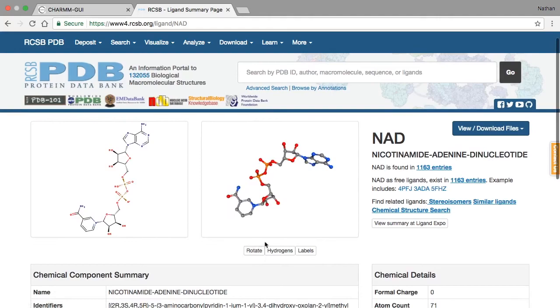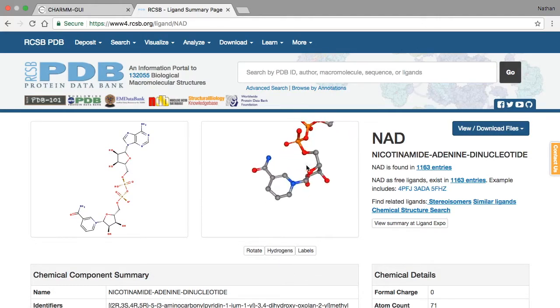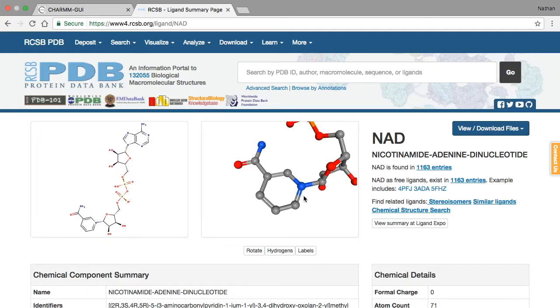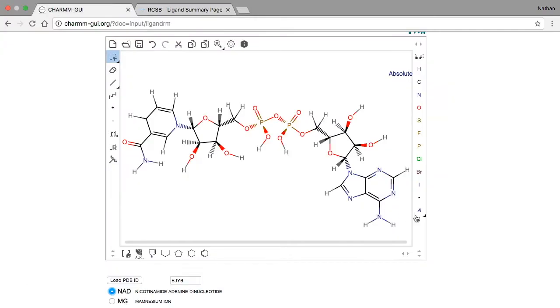The major thing to notice about this structure is that the nitrogen atom in the nicotinamide group has a double bond and two single bonds, which adds up to 4 bonds giving it a positive charge. This corresponds to the oxidized form of NAD.